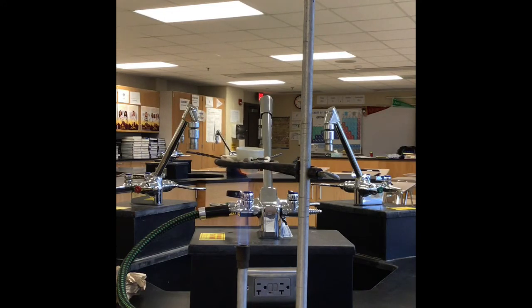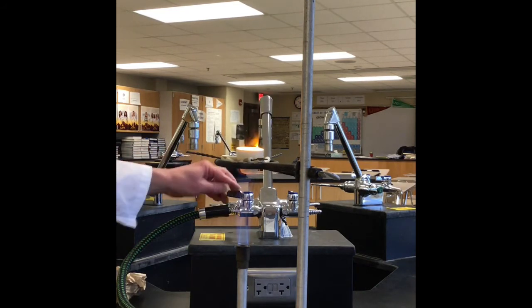It'll take a little bit for it to get going because it has to start reacting. And just a note, once it starts to react, what I can do is blow over the top of it. When you blow over the top of it, you're adding more oxygen to it. So there you can see the reaction going. You can turn off this heat.